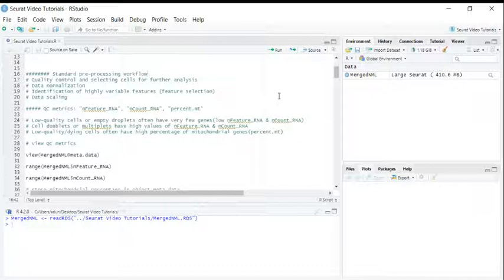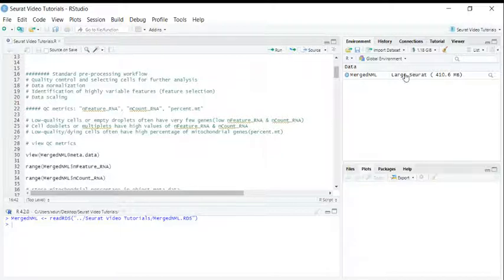Hi everyone, welcome back to my short video tutorials. So now we have a merged object.